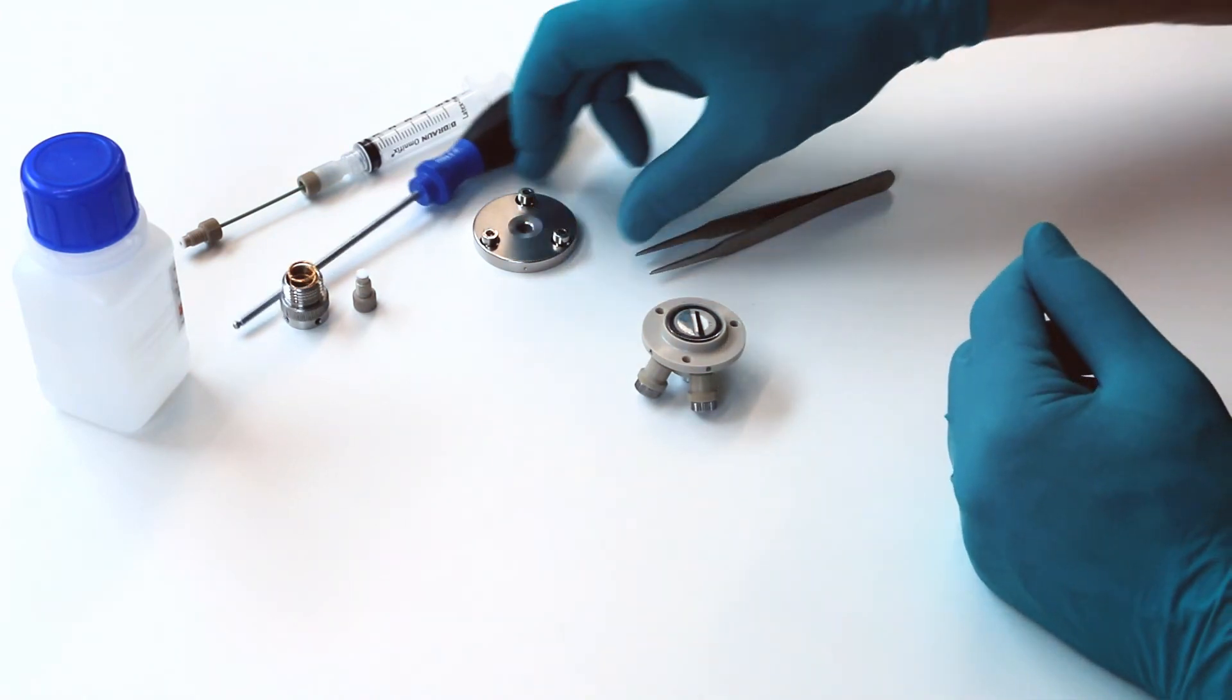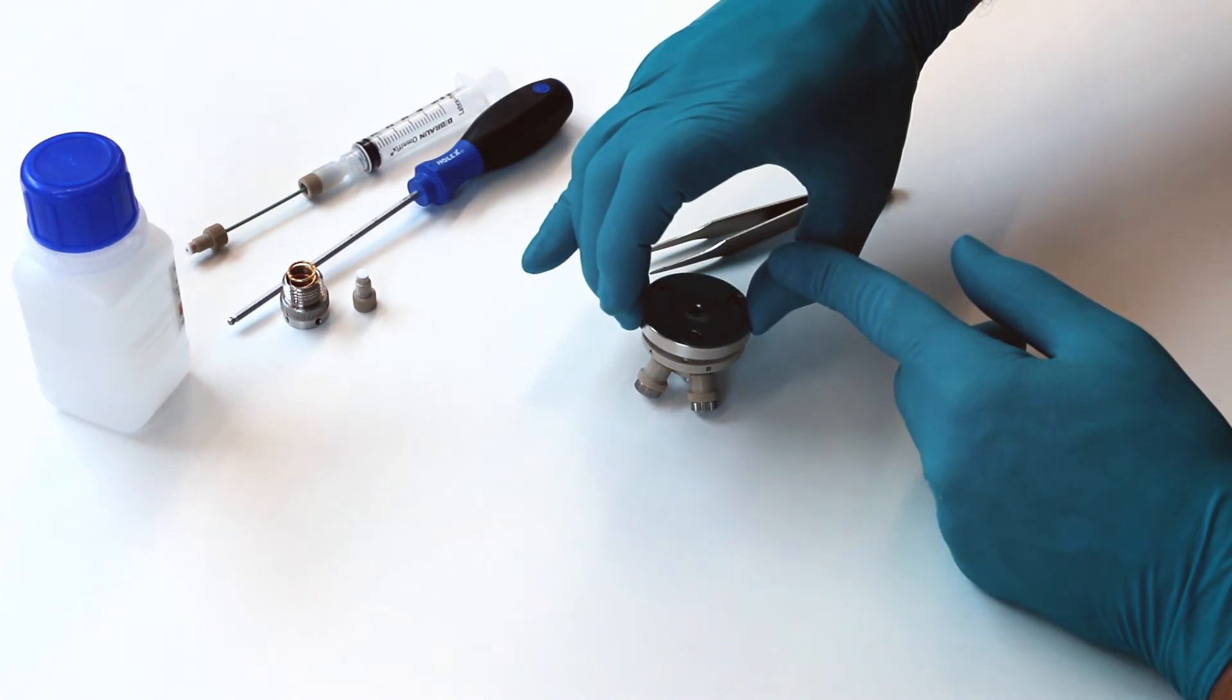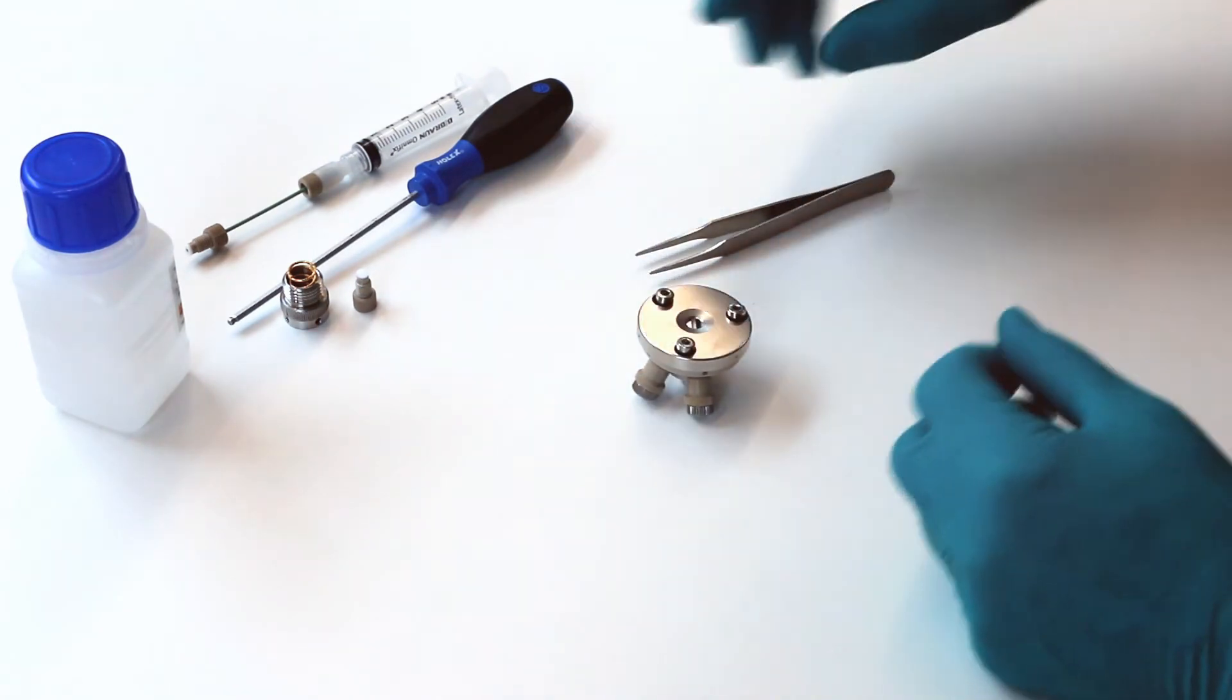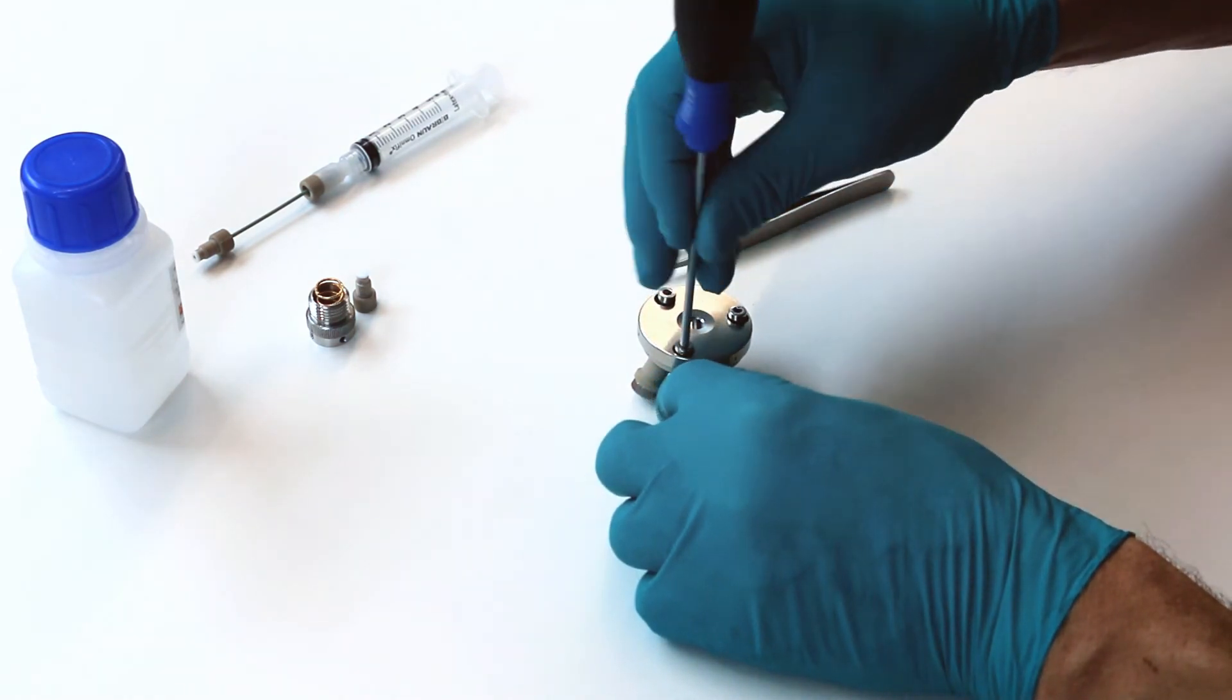Now, attach the cell lid. The cell lid used in this experiment has an inspection hole diameter of 6 mm, which is different from the standard cell lid.